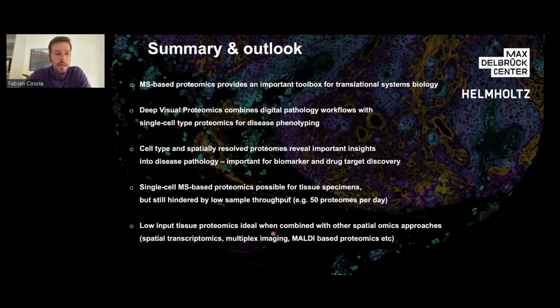And then finally, low input tissue proteomics is, I think, a very interesting and modular pipeline that could integrate well with other omics approaches. I already mentioned a few, such as spatial transcriptomics, where we, I think, in the end need to acknowledge that every technique, every method has its own weaknesses and benefits. So here, I think the most important question in the upcoming years will be how can we best leverage these unique pipelines to take the best of all these different technologies and of the different concepts that are out there.